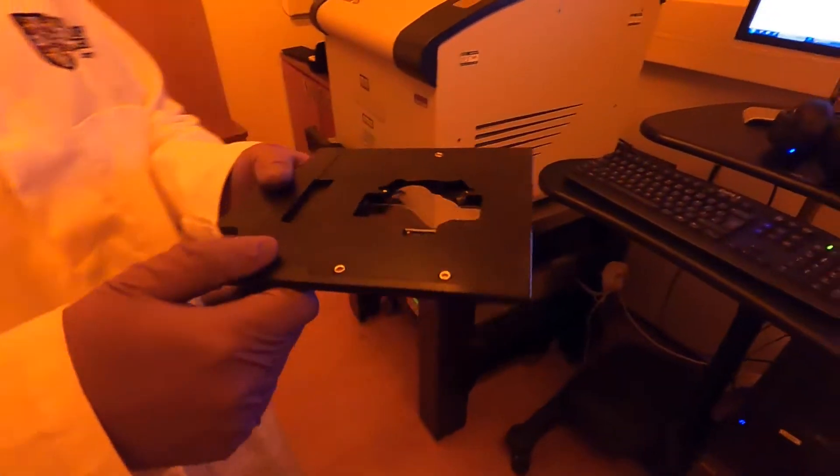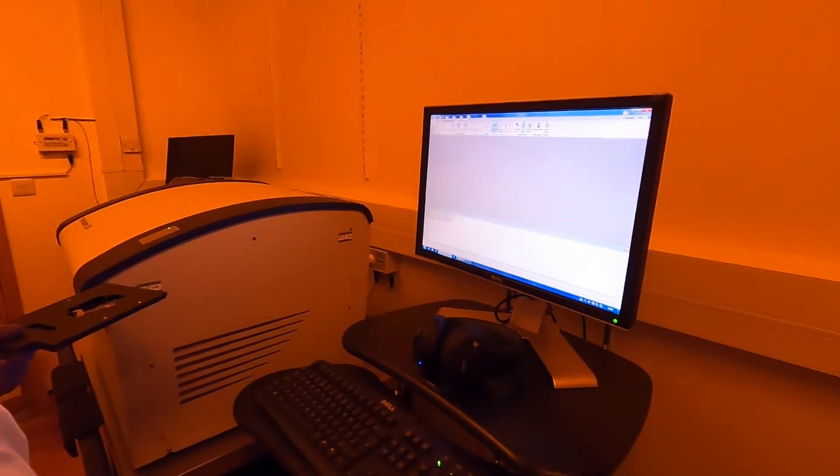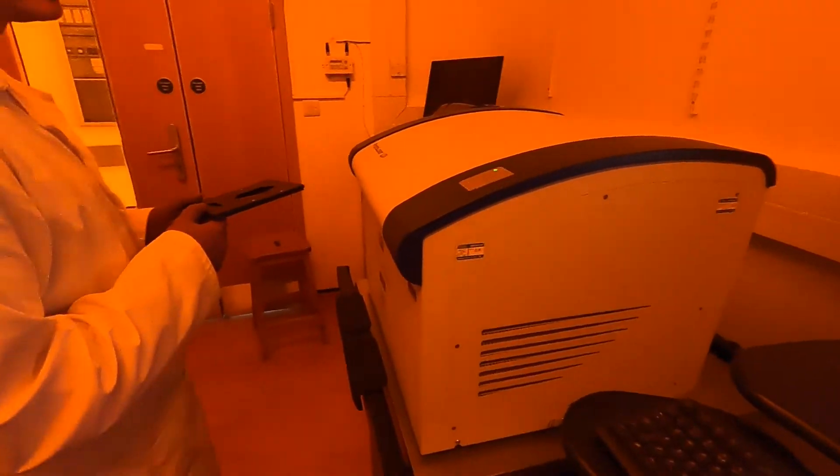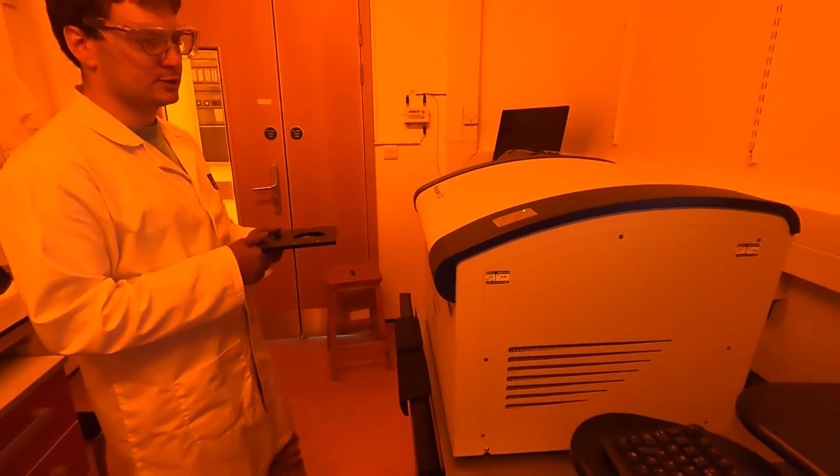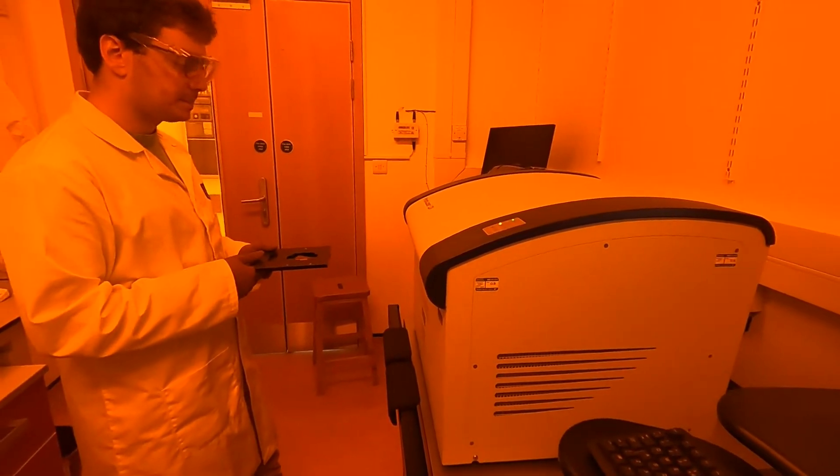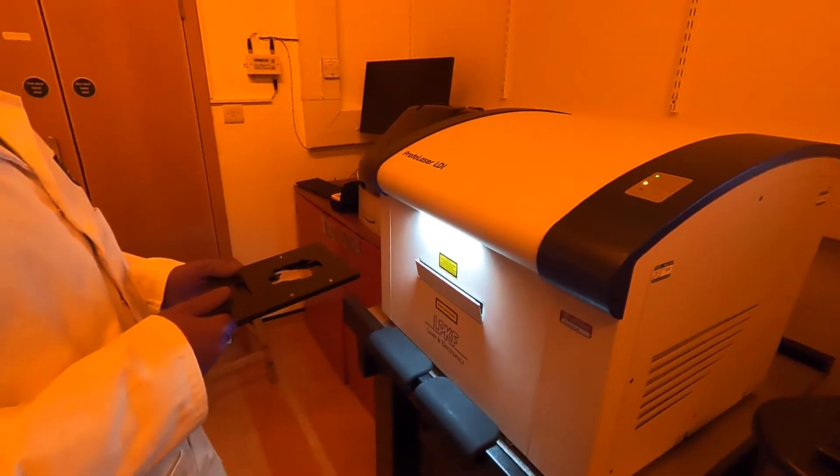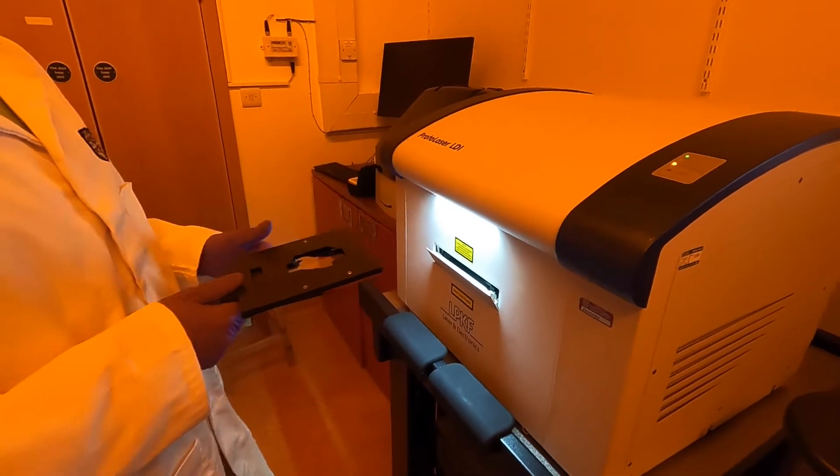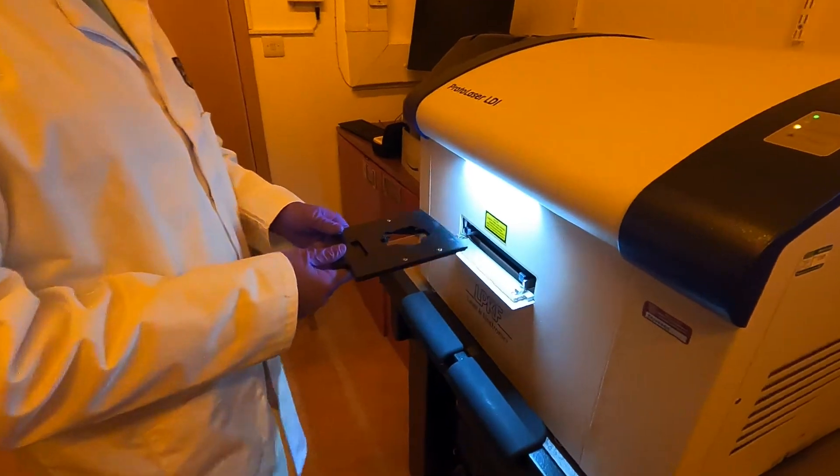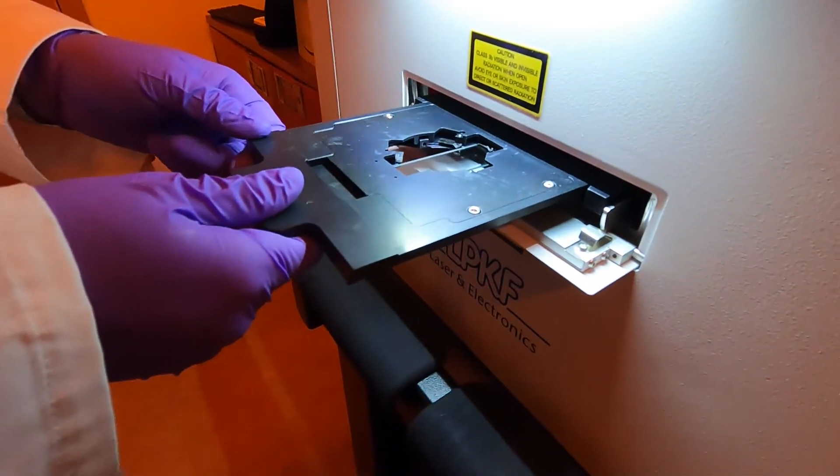We are now ready to put the sample in the LaserWriter. From the software I'm going to eject the sample tray. This usually takes 10 seconds to a minute depending on what configuration the machine is in. I'll also turn on this light. Apparently this light has been designed so it doesn't have any UV components that can expose the photoresist. Once this is completely open you can line up the top of the plate with the top edge of the holder.